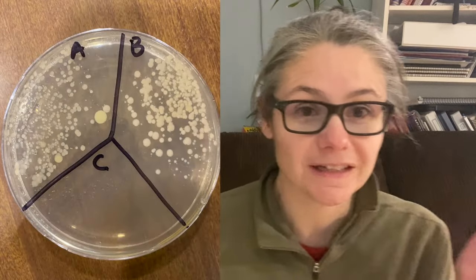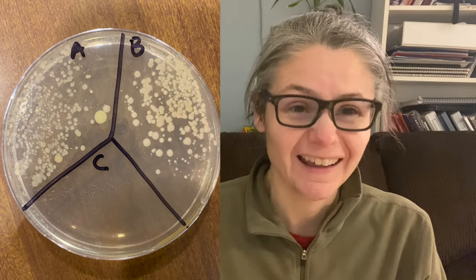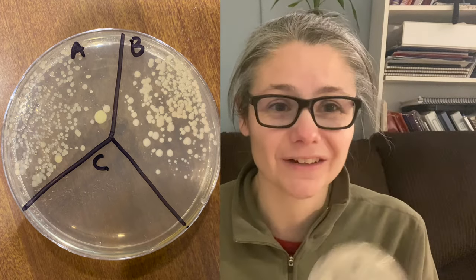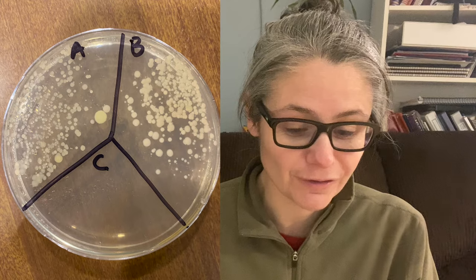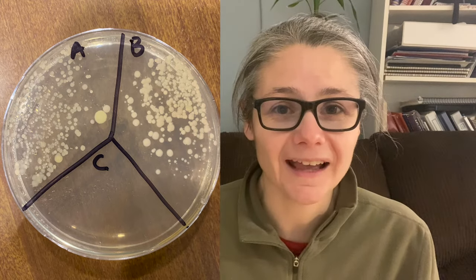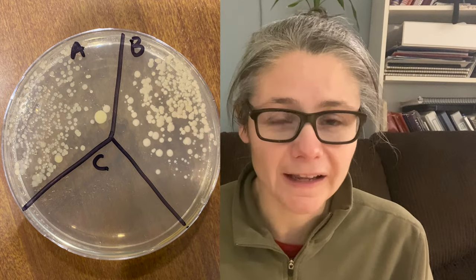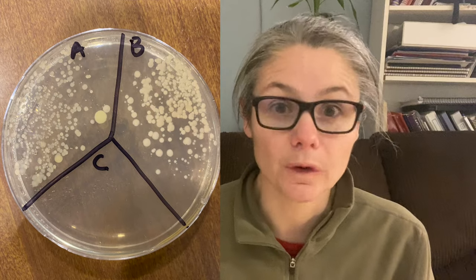Now some results for the vinegar, baking soda, and tea tree oil. As you can see here, the before section has a lot of bacteria in it, and unfortunately the after section also has a lot of bacteria in it. I would say that the baking soda, vinegar, and tea tree oil combination is not an effective cleaner for the toilet bowl.